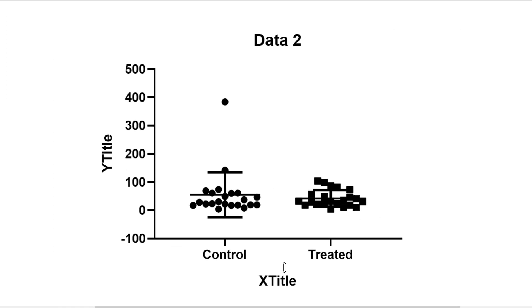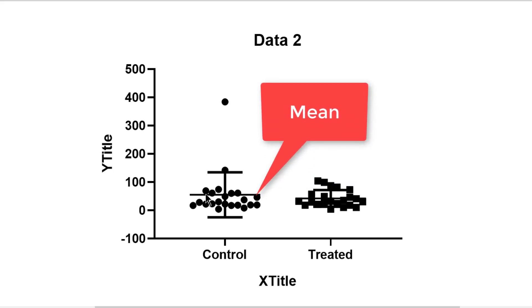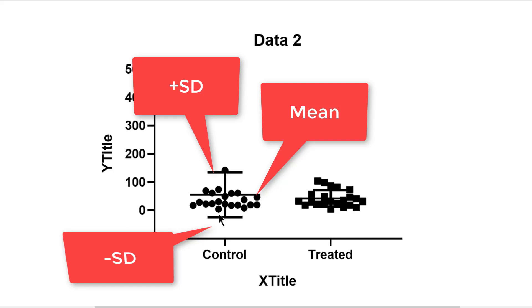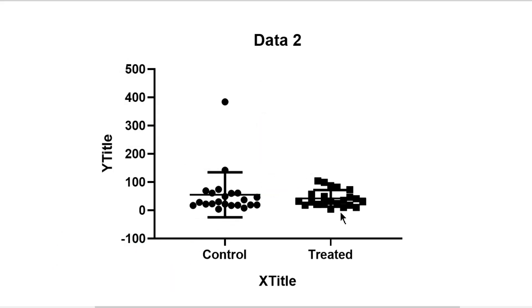Here is our scatterplot. For the control group you can see each replicate value has been plotted along with the summary data — the midline is the mean value, the bar protruding from the top is the standard deviation above the mean, and the bar at the bottom is the standard deviation below the mean. For the treated group the data points are so compact and closely aligned that it's hard to visualize this summary data. So I'm going to change the appearance of this graph to present it more suitably.